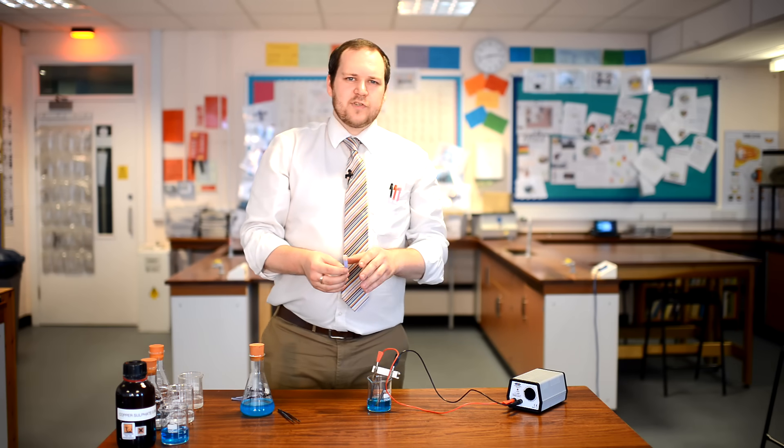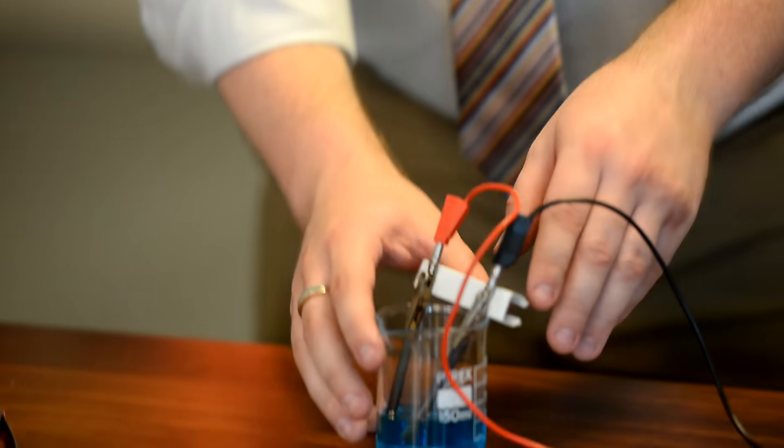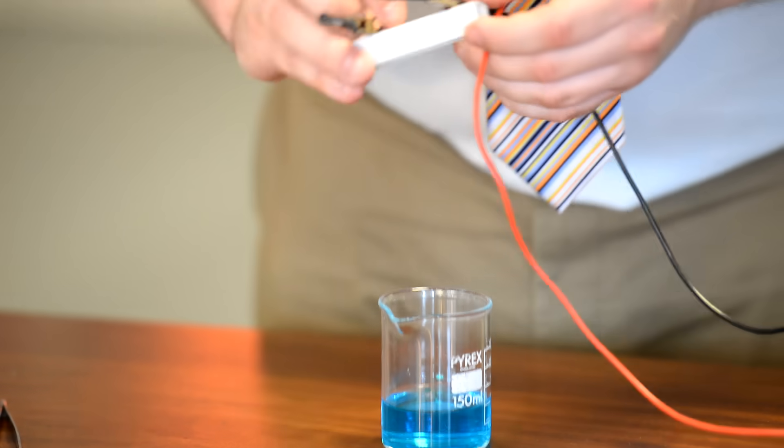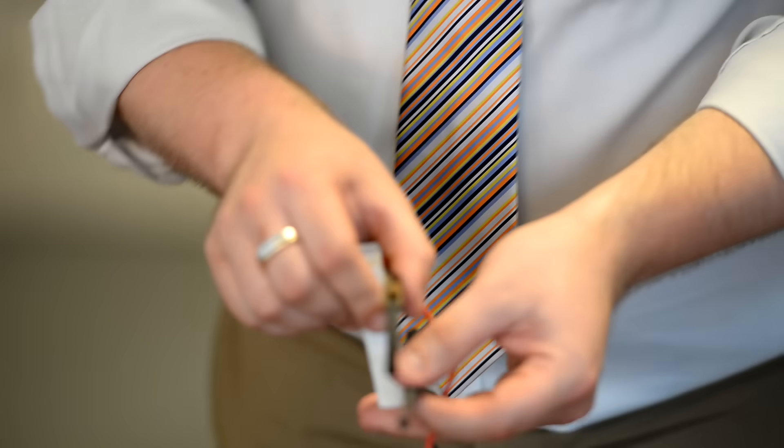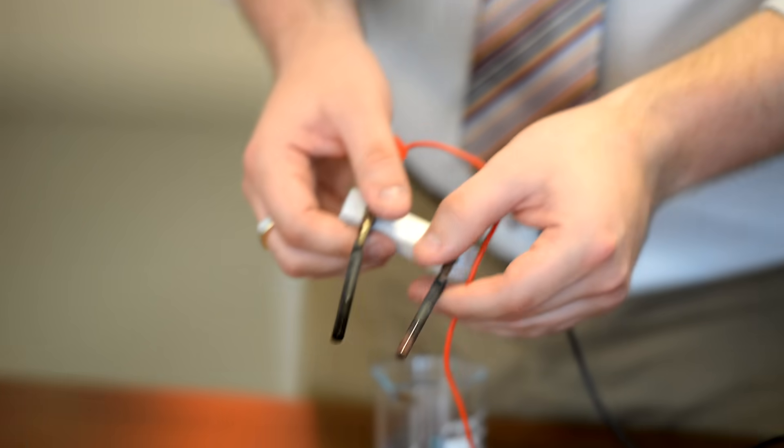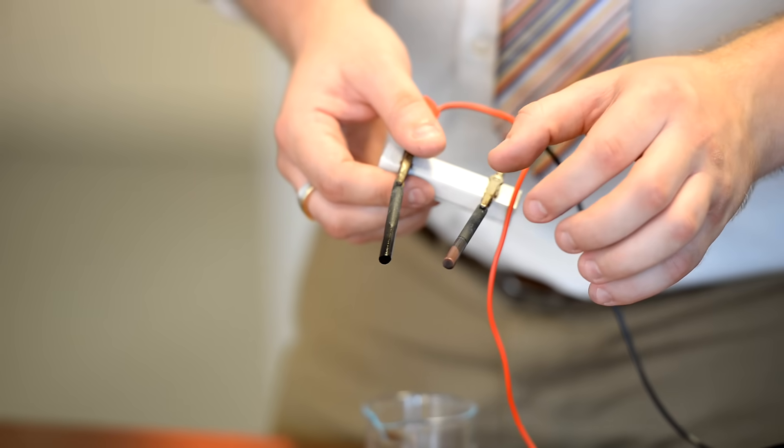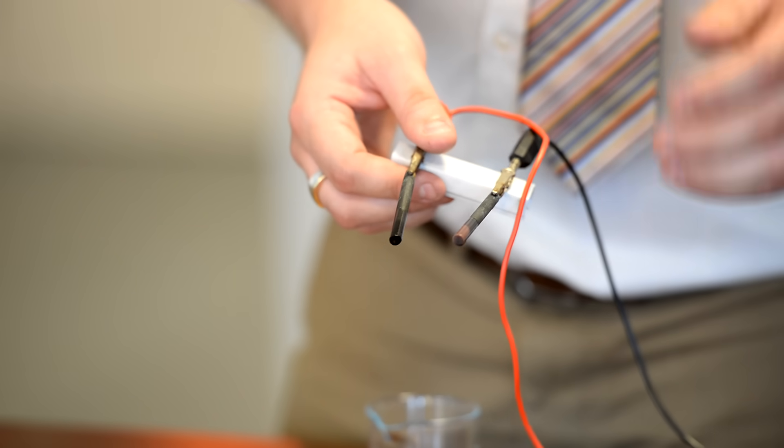At the cathode, I'll turn this off so we can see this, we should see that copper has started to form around the bottom of it, so where it was submerged in the copper chloride, copper metal crystal has formed from the copper ions.